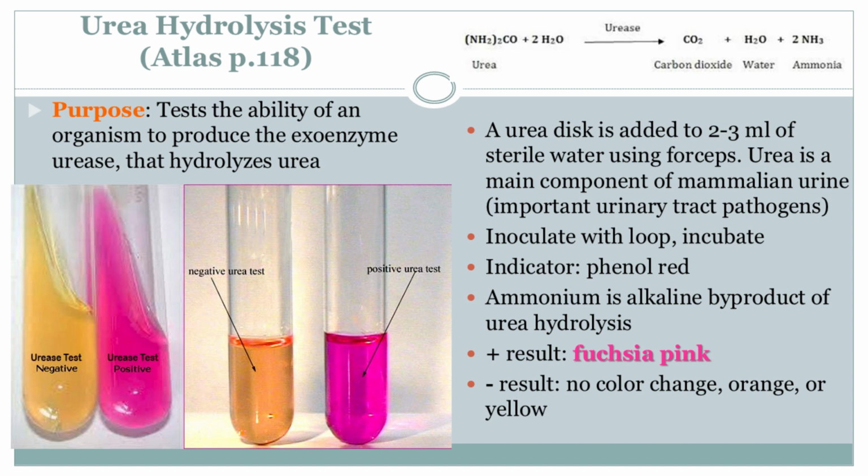You're right, it has real-world implications. Like what? Give me an example. Take Proteus mirabilis, for instance. Proteus mirabilis. Doesn't ring a bell. It's a common culprit behind those pesky urinary tract infections, UTIs. Oh, UTIs. Those are no fun. And guess what? Proteus mirabilis is a champion urease producer. So if we pop a sample from a patient with a suspected UTI into the special broth and it turns bright pink, Bingo. It's a strong indicator that Proteus mirabilis might be the troublemaker. It's like a bacterial fingerprint.